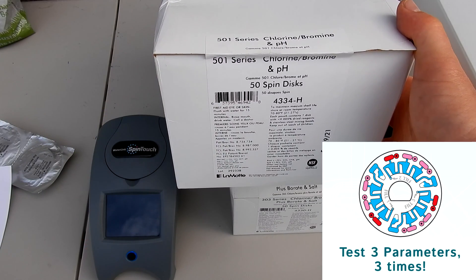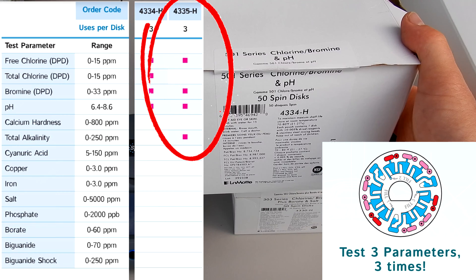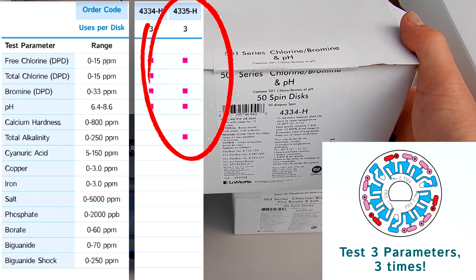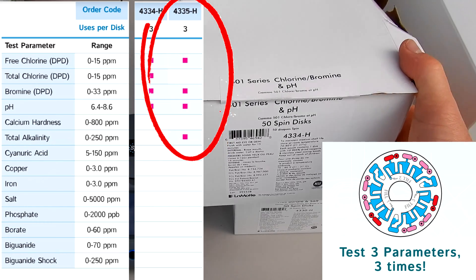They also sell the 4335-H, the 601 series, which is also a three-use disc. It does free chlorine or bromine, pH, and alkalinity.